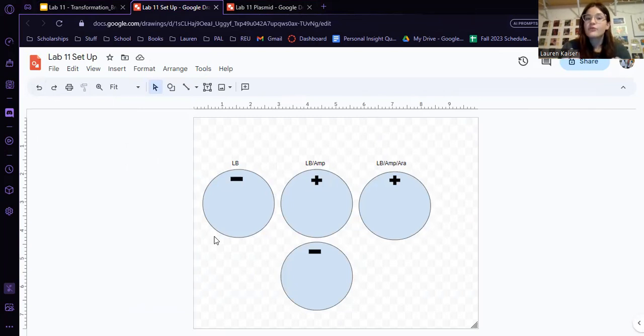This is going to show you that the bacterial sample that you were working with was viable, meaning that it was live, that you were growing things, that they were healthy, they were happy, there was nothing wrong with them. So that any further results that you get, they were because you changed a variable. So then you can compare that to your positive and negative on the LB amp. So the LB, remember, is just nutrient. The amp stands for the ampicillin.